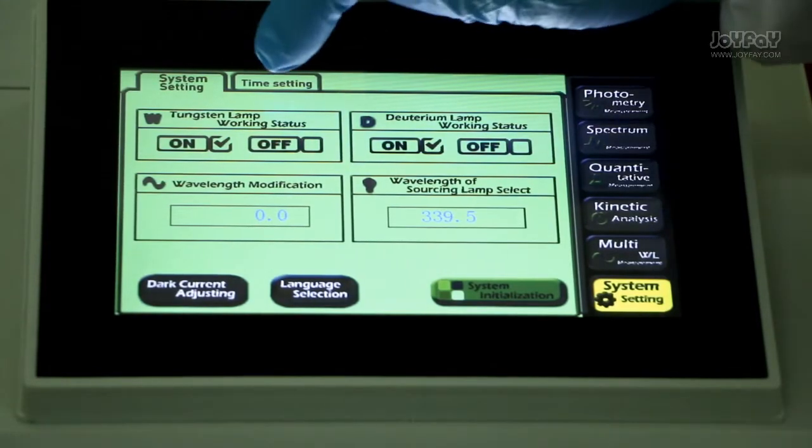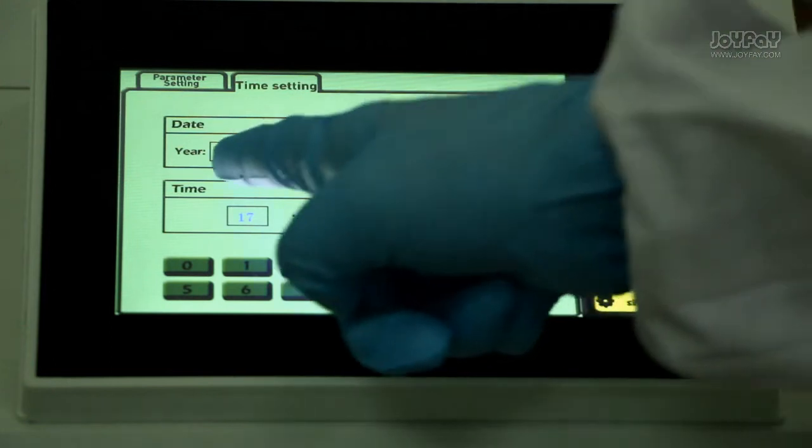Time setting. Here you can set the time as you need, like year, month, etc.